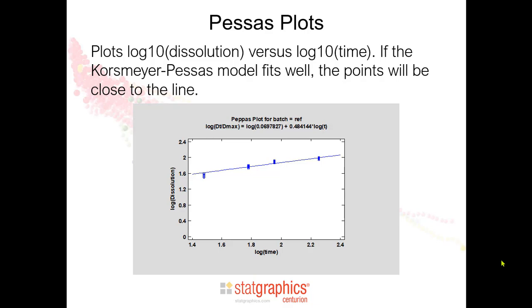A similar plot created by the model fitting procedure is the Peppas plot. This plot plots the log dissolution versus the log of time. If the Korsmeyer-Peppas model fit the data well, the points would again be close to the line.